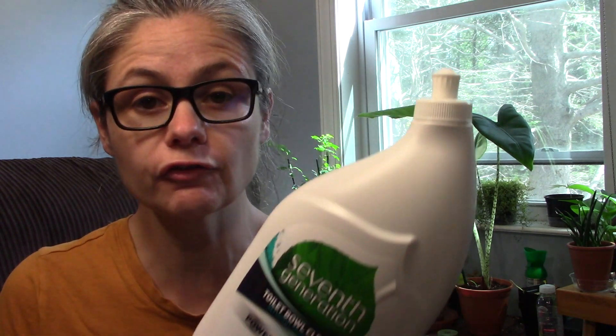I really enjoyed testing the 7th Generation Toilet Bowl Cleaner. Sometimes it's good to use a cleaner that isn't full of bleach in my toilet bowl because I do have a septic system, so I feel comfortable using this in my toilet more frequently than I do a product that has bleach in it.